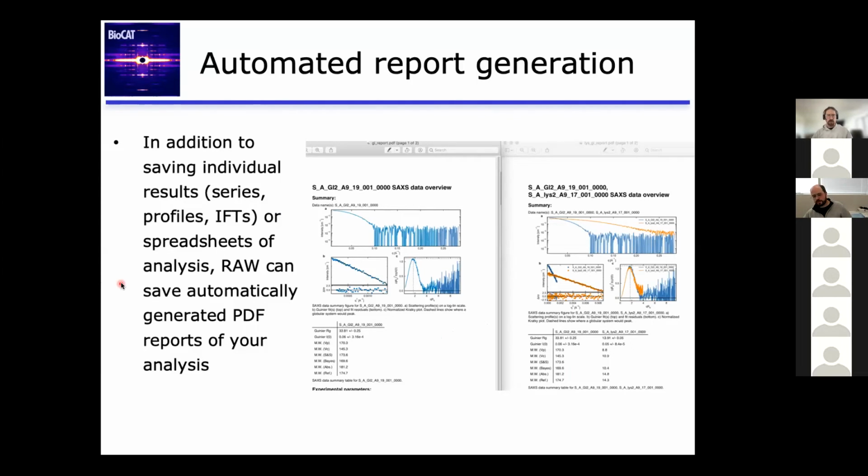One question that did occur to me as you were walking through the demo, though, is there anything in the GUI that would facilitate a user learning the GUI and then starting to transition to the scripting or the Python API? There's nothing in the GUI that explicitly pulls in the scripting. It's the same package, but it's fairly separate. So you usually learn the GUI using the tutorials online, for example, and then there's also tutorials for all the API stuff, but they're fairly disconnected.